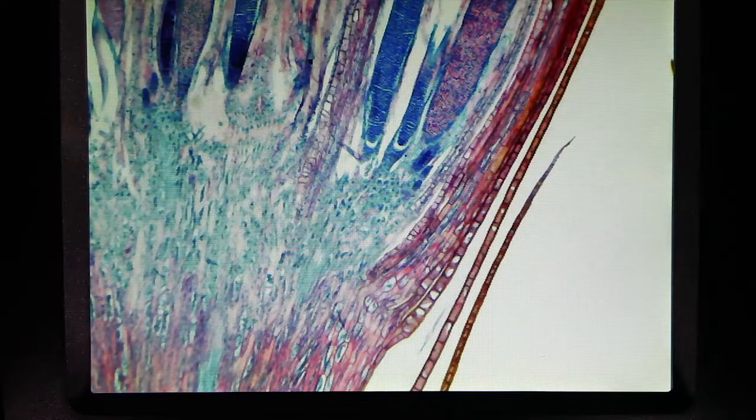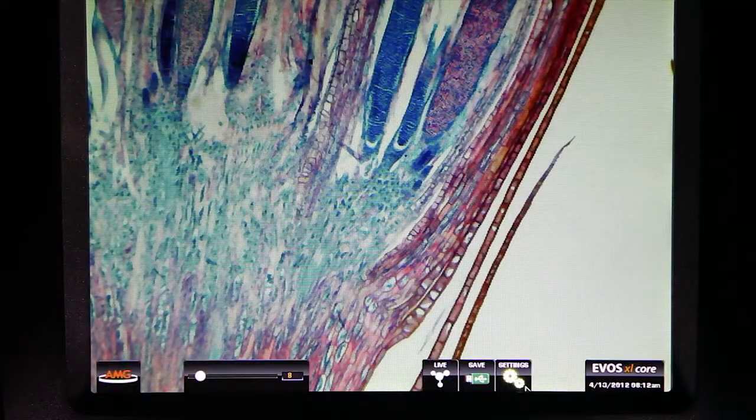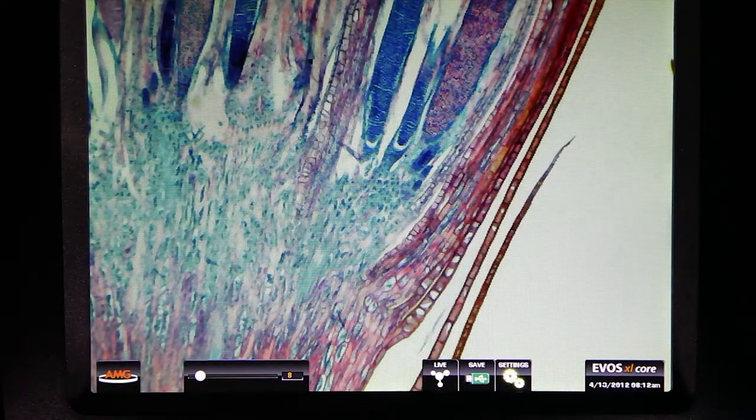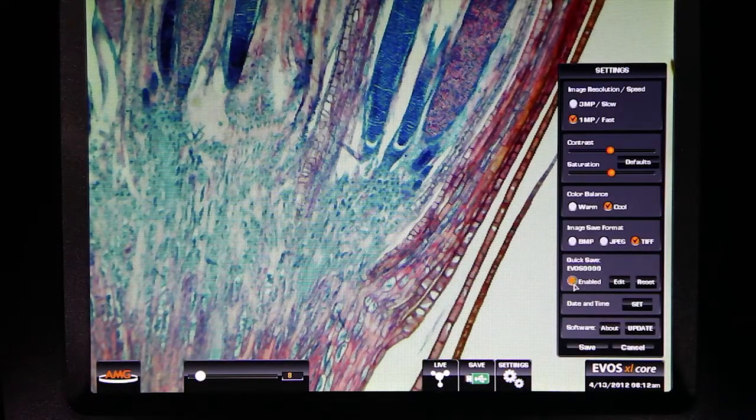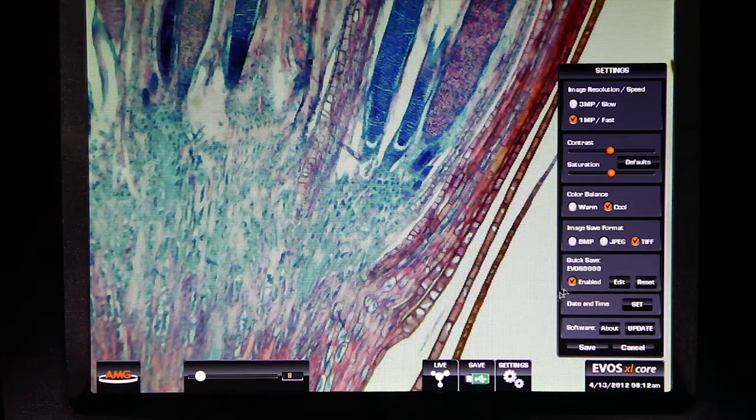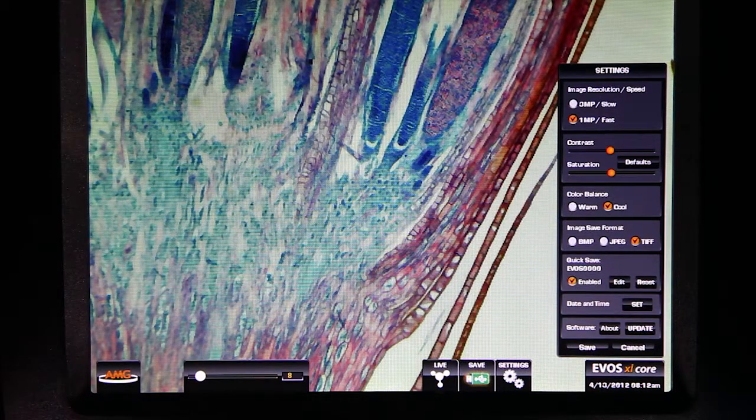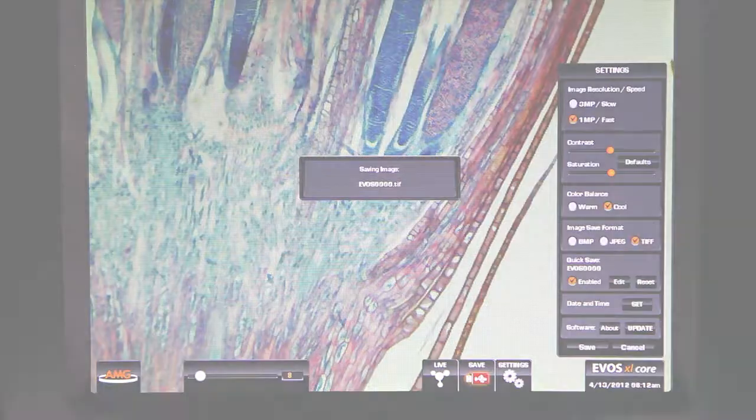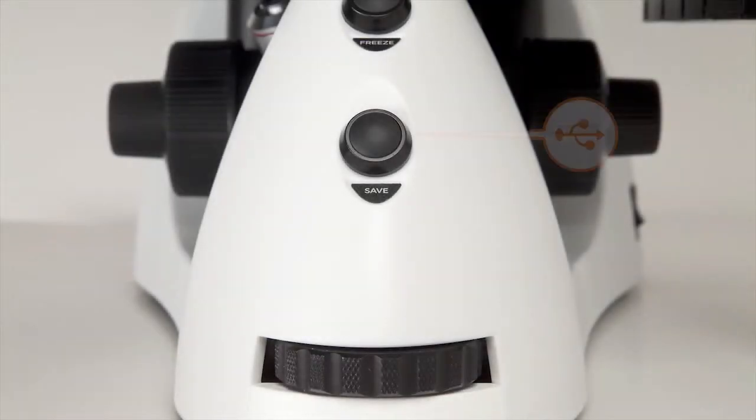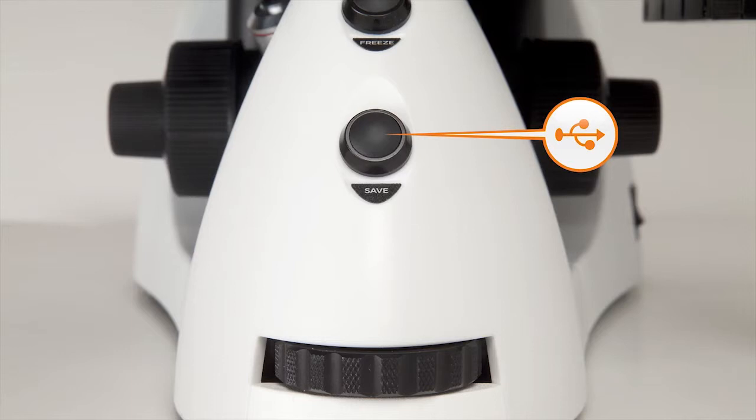To use the quick save I just set up, I simply enable quick save in the settings menu and click the save icon on the screen. However, if you use the manual button on the front of the scope, the quick save is automatically enabled and used.